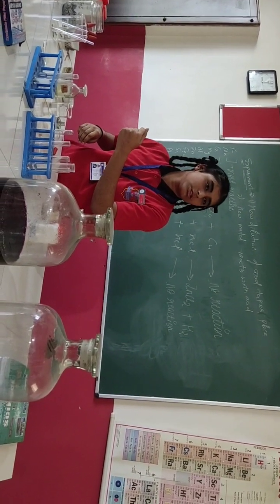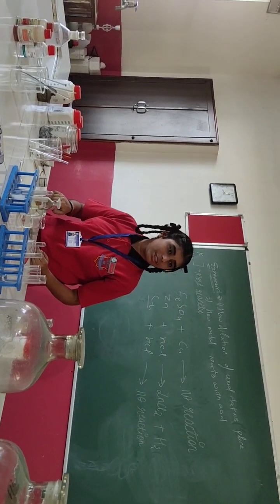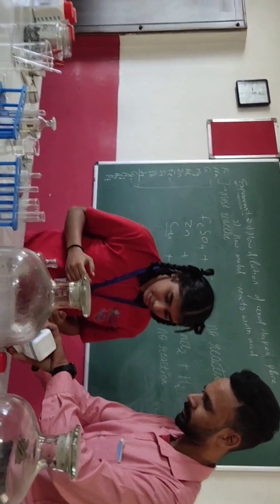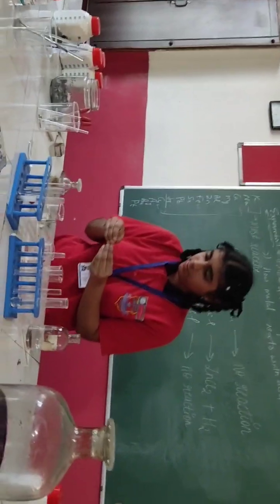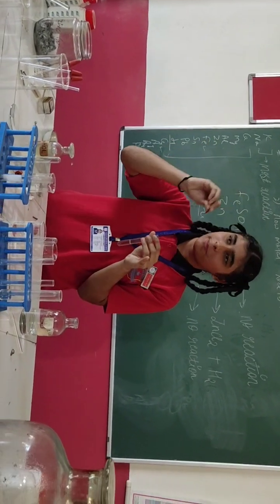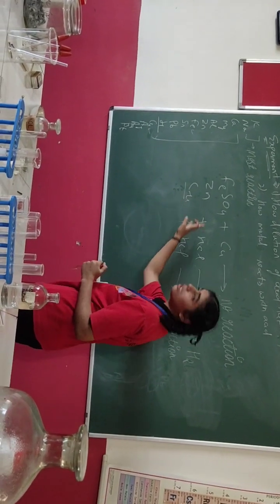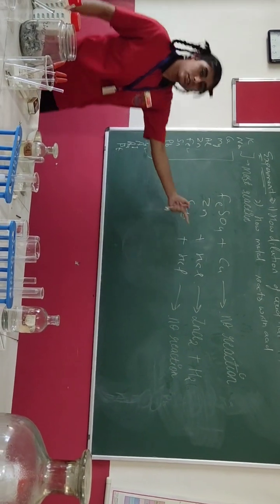She had one question here. So here is copper. Now again this includes HCl, we will add copper. No reaction will take place. Why? The reason behind it is that copper is less reactive than hydrogen in the reactivity series. So no reaction will take place.